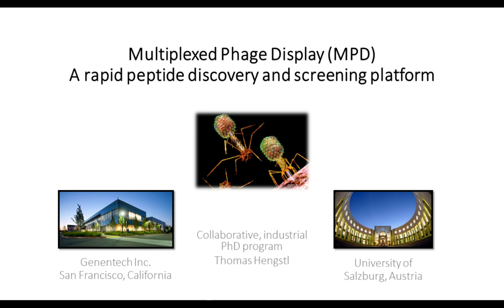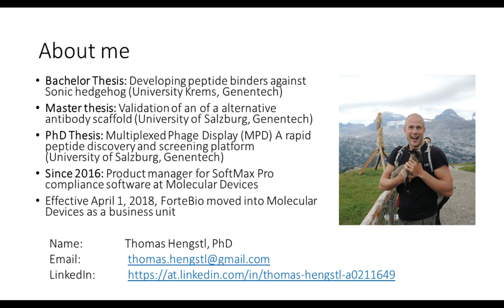Okay, well, thank you, Alexis, for this nice introduction, and welcome to today's webinar about Multiplexed Phage Display, which is a rapid peptide discovery and screening platform. So, a little bit about myself, in addition to what Alexis told you. I did my bachelor thesis in Krems, which is in the lower Austrian part, as well as with a cooperation at Genentech, where I did the actual research lab. And the bachelor thesis was about developing peptide binders against sonic hedgehog.